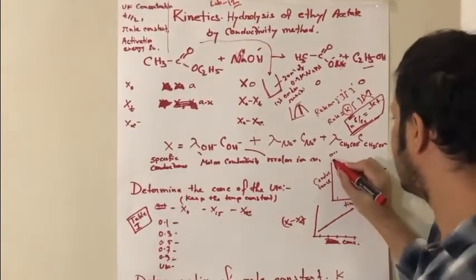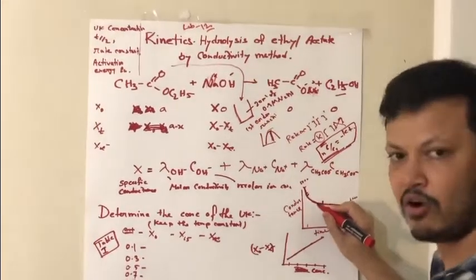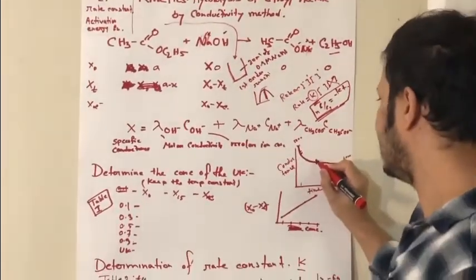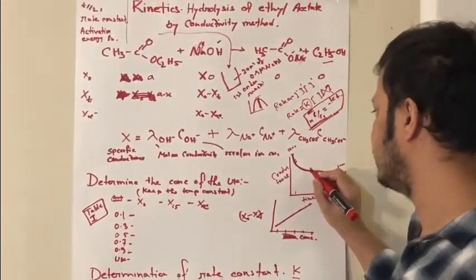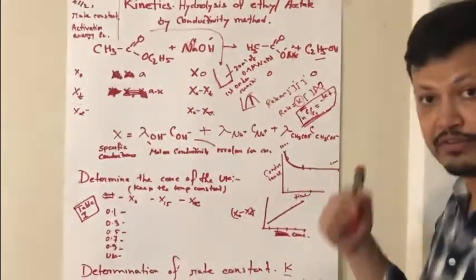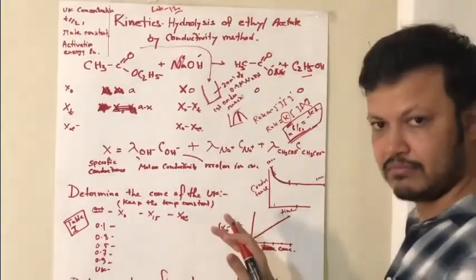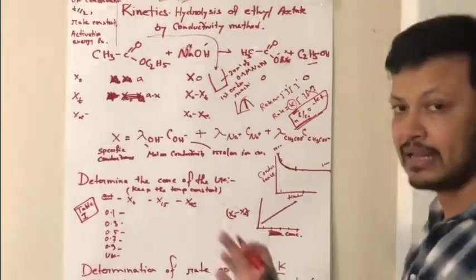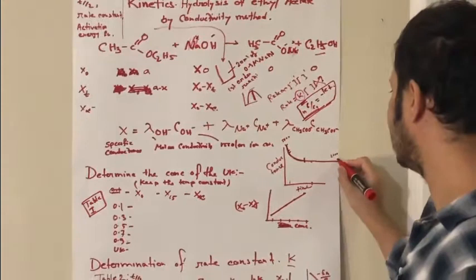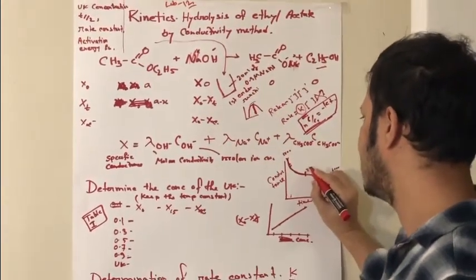So you got 5000, and you also have all the other values here. After taking the data continuously for 15 minutes, during which you definitely need to stir it, you don't have to bother about that, you just keep it. Then after 1 hour you will take the data again. Suppose after 15 minutes the data is around 2300.